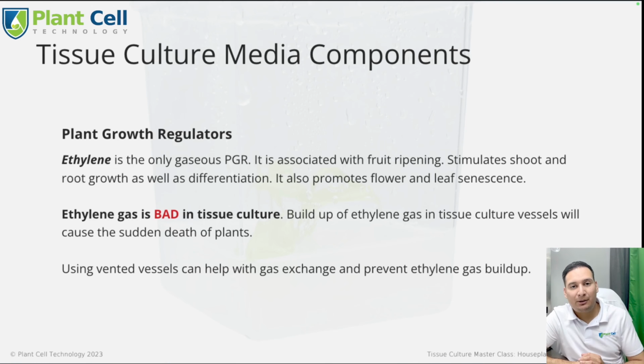I will make a video on agar versus gellan gum, which ones to choose for which plants in the future. But at least for plant growth regulators, that's usually what I use.